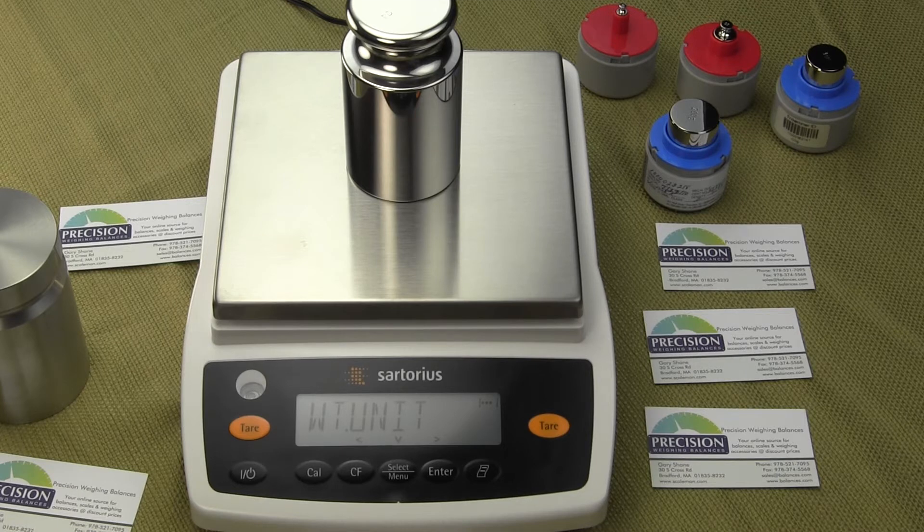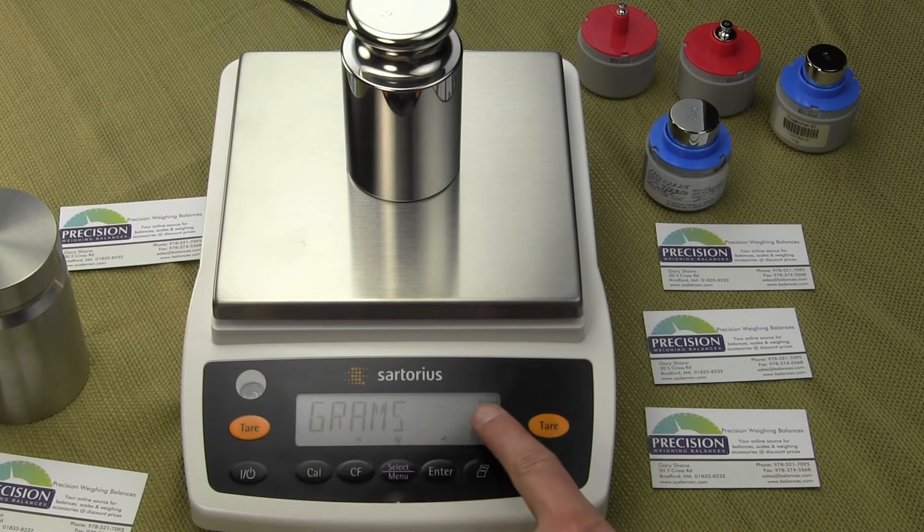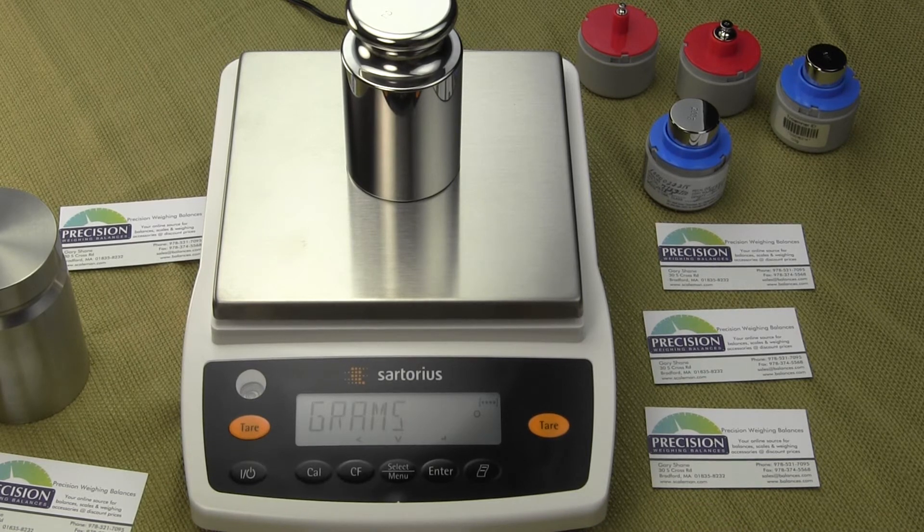We need to change the unit weight. The default is grams. We want to configure the balance to weigh in pounds when it powers up all the time. To do this, we're going to select the enter key. You'll notice it says grams and there's a circle on the right-hand side — that circle means the balance is configured for grams. We want to change that to pounds, so we'll simply select the select menu key or the down arrow to scroll through the weigh units.